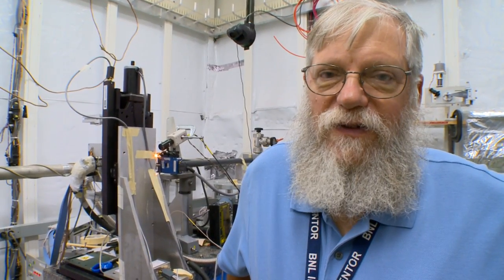I'm Peter Siddons. I'm a physicist here at the Light Source, and my main efforts these days are devoted to developing advanced new detector systems for synchrotron radiation applications, mainly in the X-ray regime. So what I've got here is a setup for scanning fairly large objects fairly quickly.